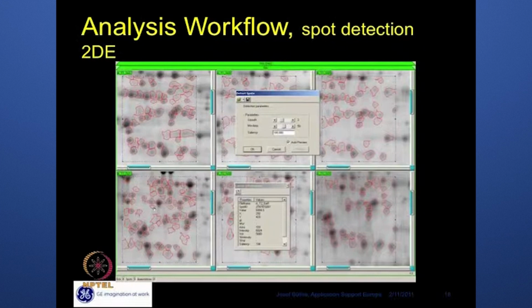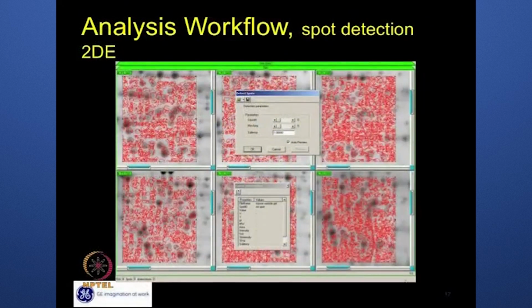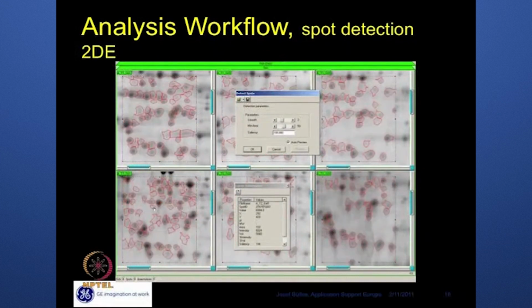I think the main thing is, first of all, one would like the software to detect as many spots as possible in a very accurate way, and then whatever is left over, because I can see in your first image, at the top left, there is some spot which the software was not able to detect. Those spots can again be detected in the manual way, by adding the spot. Yes, that is the advantage of having this tool.